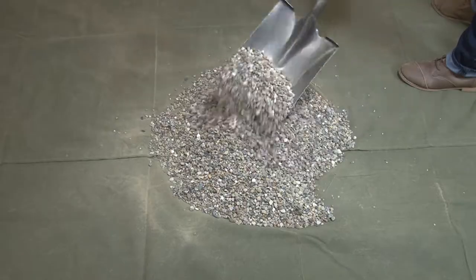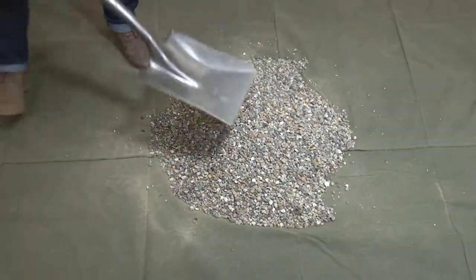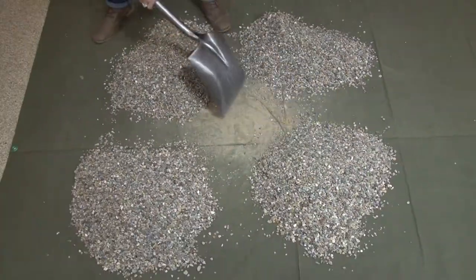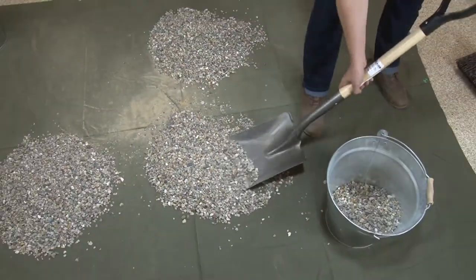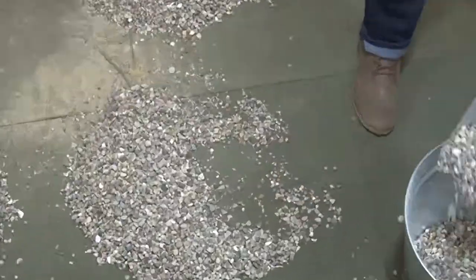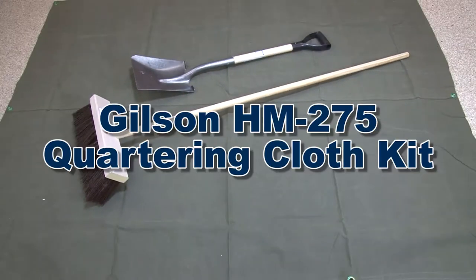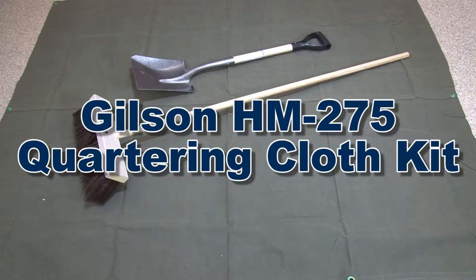Following ASTM and AASHTO standards, using the HM275, successfully mix and quarter the original bulk sample until the desired sample quantity is obtained, making the Gilson HM275 Quartering Cloth Kit the right choice for your material testing lab.